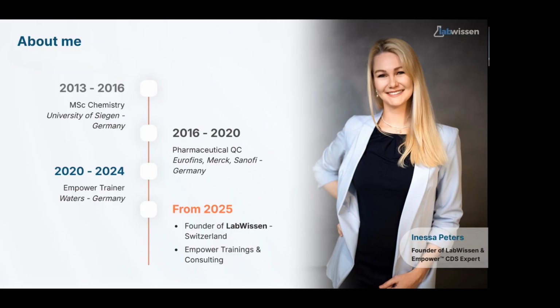So, you probably all work in Empower, I suppose so. And you know that the topic of custom fields is quite broad. So usually it takes a full day of training to cover all possible functions. And as I was preparing this webinar, I focused on giving you the most valuable knowledge in a short time. So following the Pareto principle, you'll learn roughly 20% of the functionality that will help you create 80% of your custom fields, let's say so.